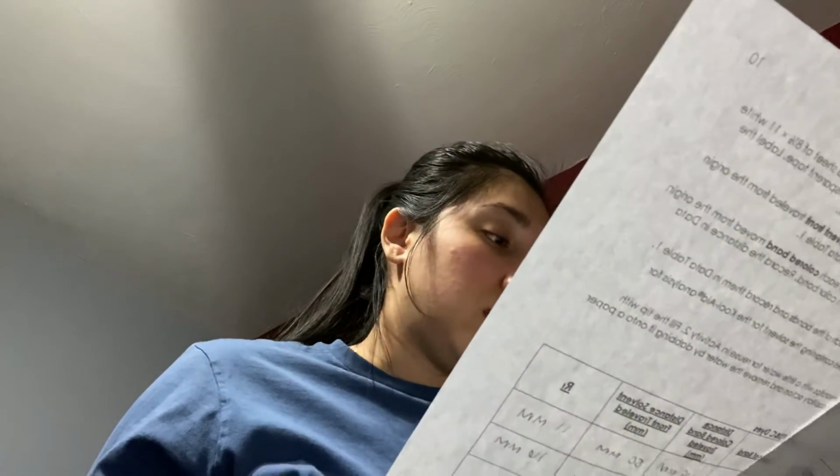oh yeah, this one was for us to calculate the colors of the bands and then the FD&C dyes. So we used red dye, yellow dye, and blue dye from our lab kit.